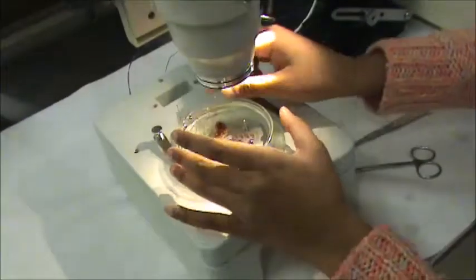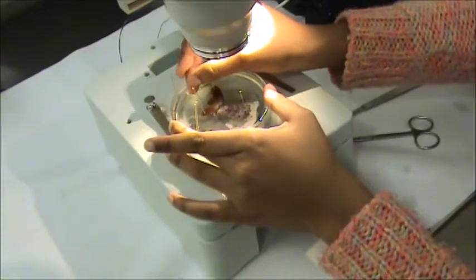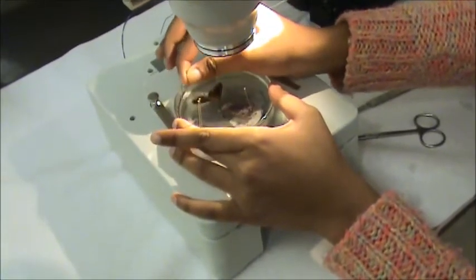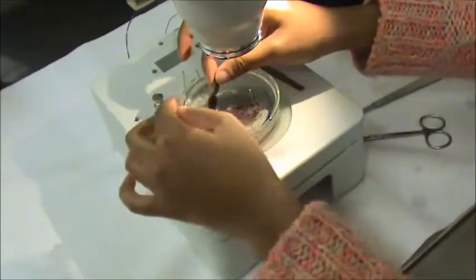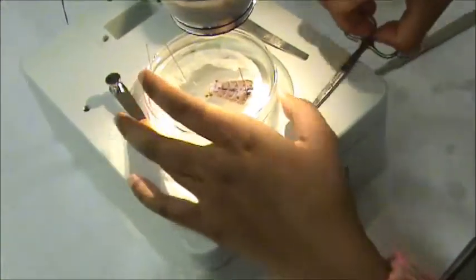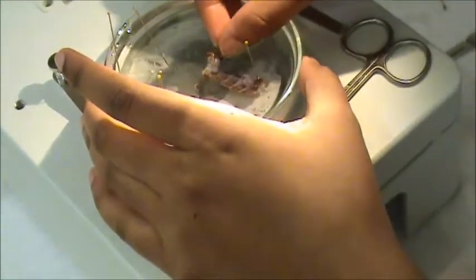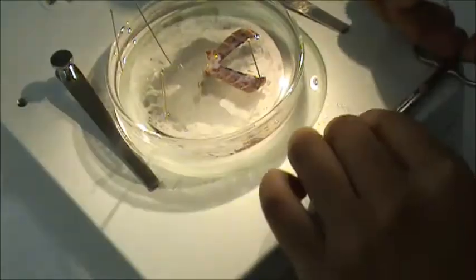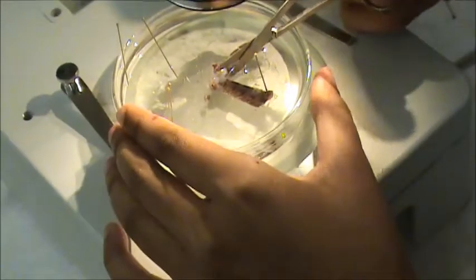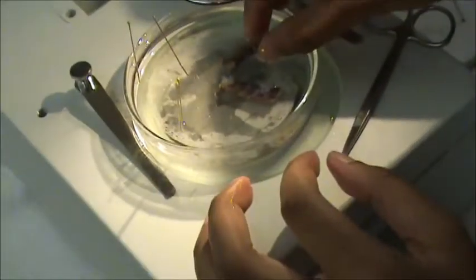So now that we've cut that off, we can get rid of this dead tissue. And then we can separate these two, so we can use one half for another dissection or preparation. Didn't cut this all the way. There. You can take this half and put it in some saline.